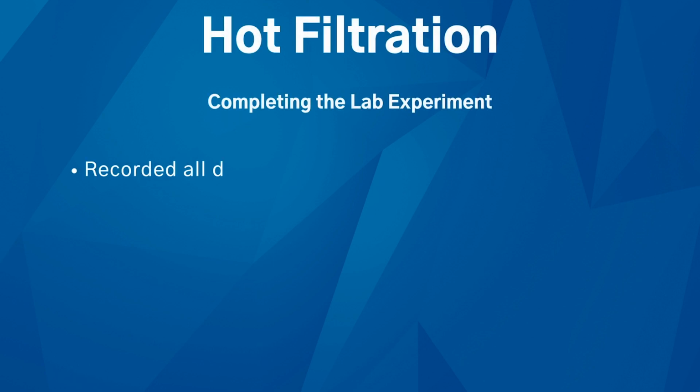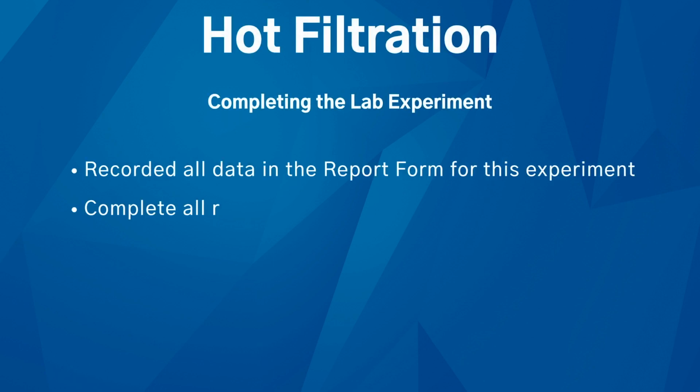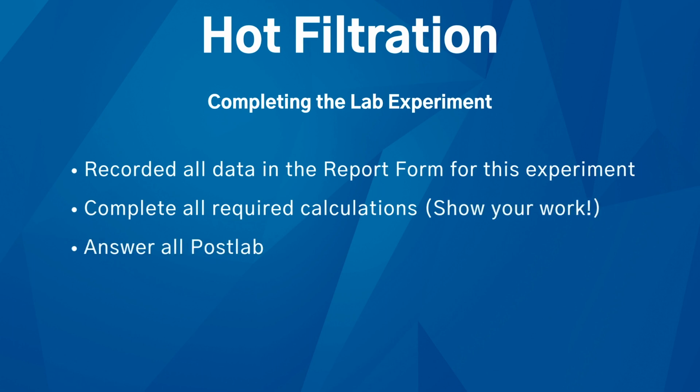And with that, you have all the information you need to perform your calculation and to complete the post-lab questions.